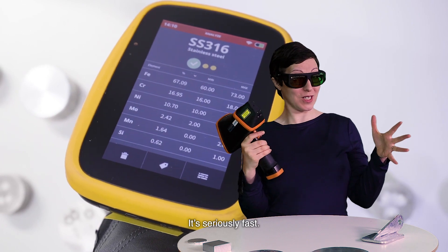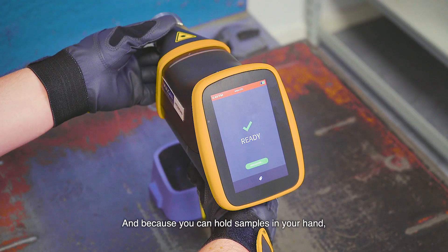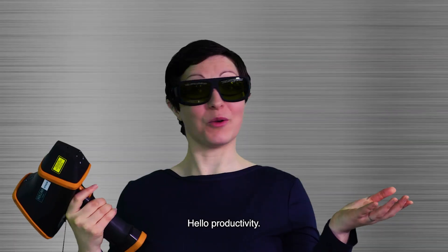It's seriously fast. One second and you know exactly what you're looking at. And because you can hold samples in your hand, it's all over in a flash. Hello productivity.